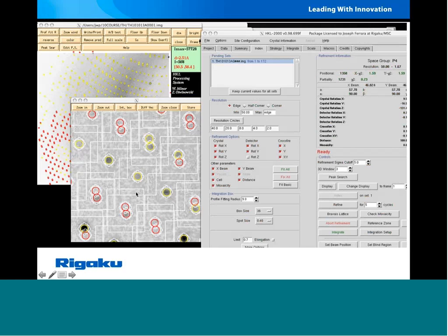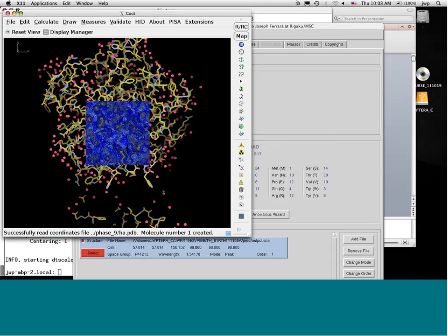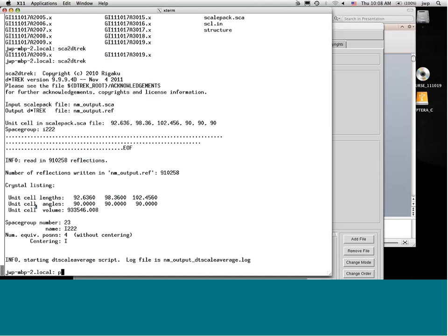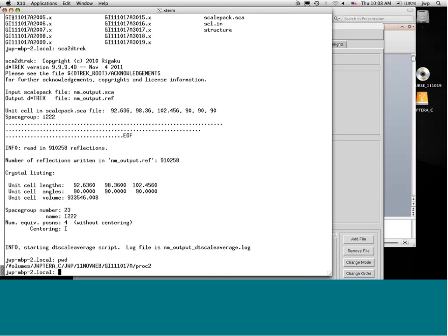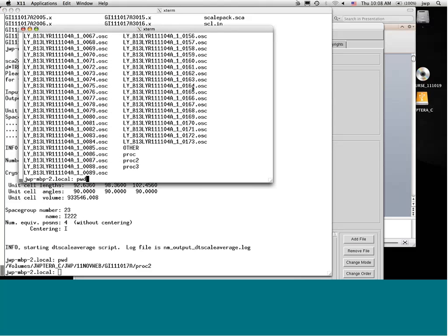And I'll pause now to show you how I get to this stage with a lysozyme crystal here. So one of the things, let's jump out here. And Angela, you're going to have to tell me if this is showing up, my whole desktop. Is that right? It is showing up. Okay, thank you.